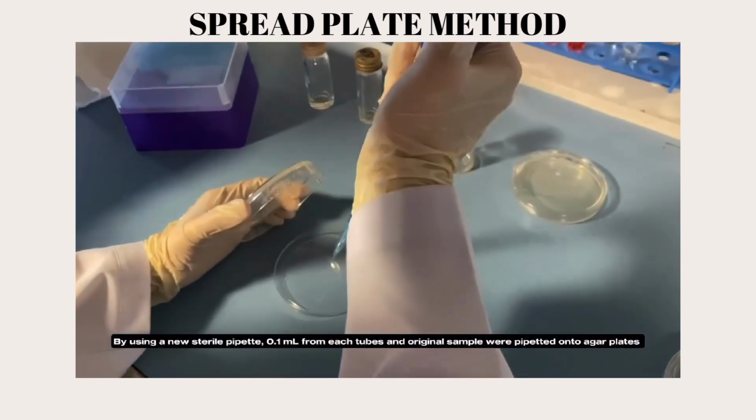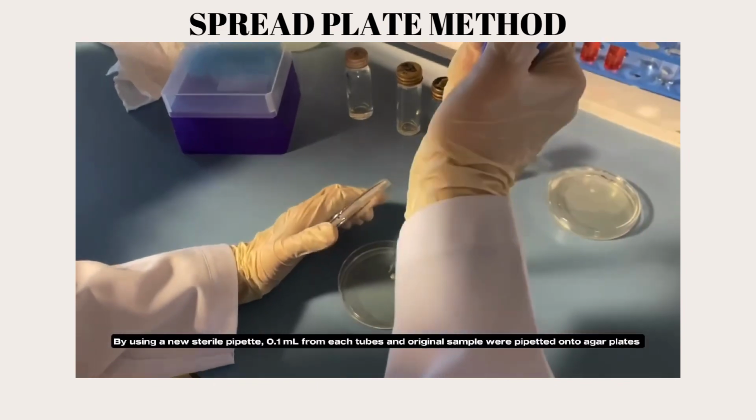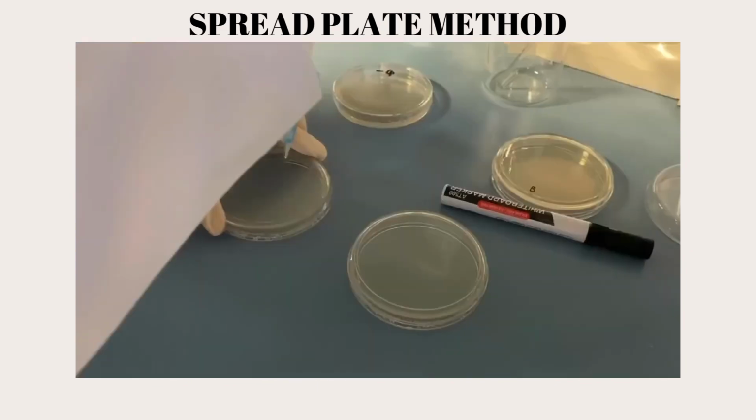By using a new sterile pipette, 0.1 ml from each tube and the original sample were pipetted onto agar plates.